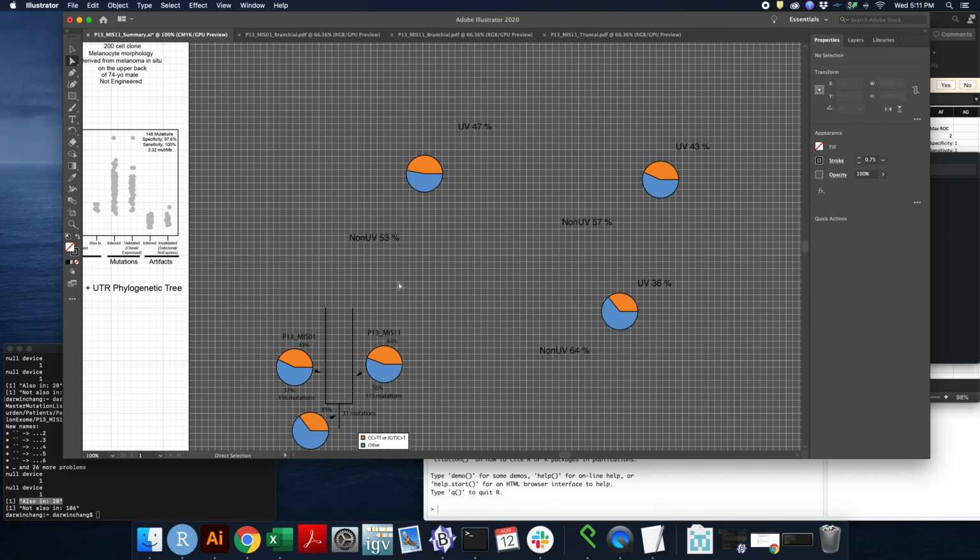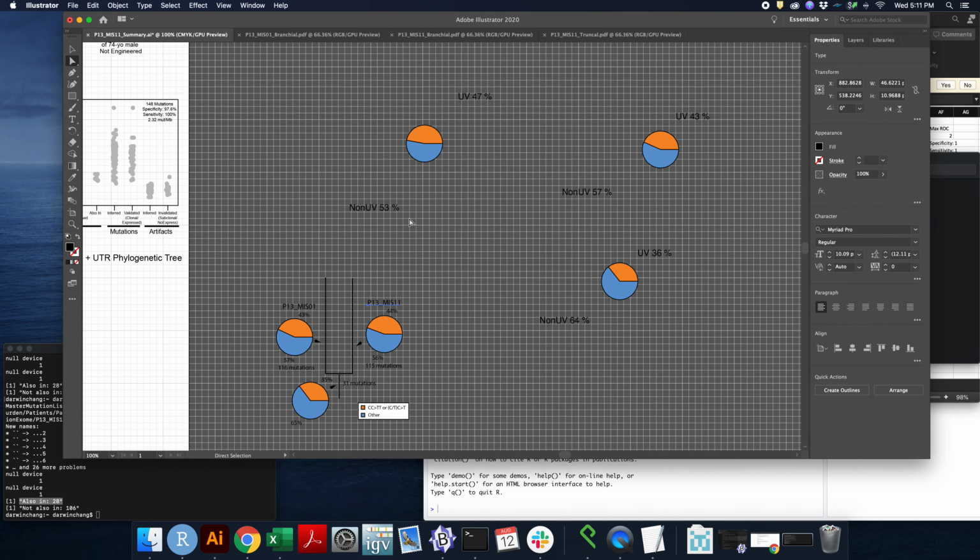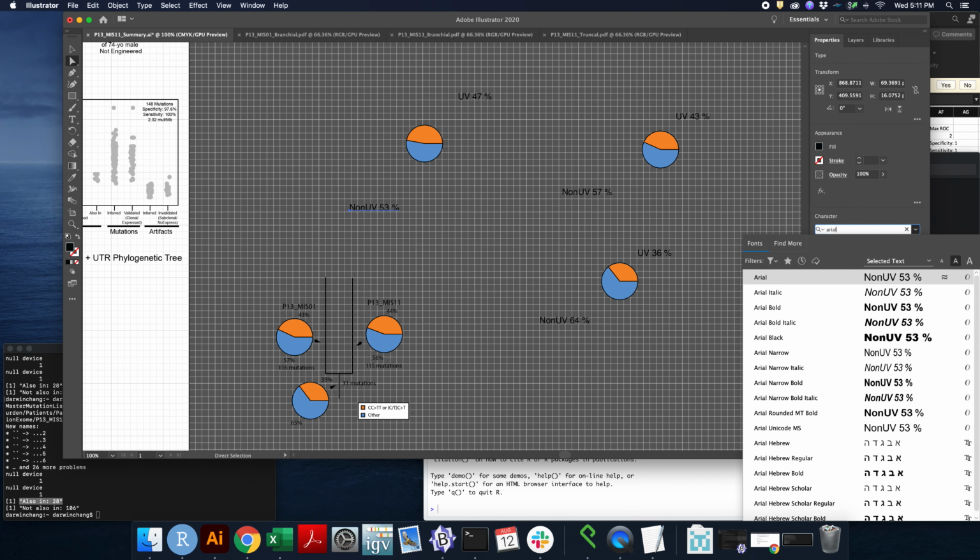Okay, then we need to make sure that we are in Arial font.